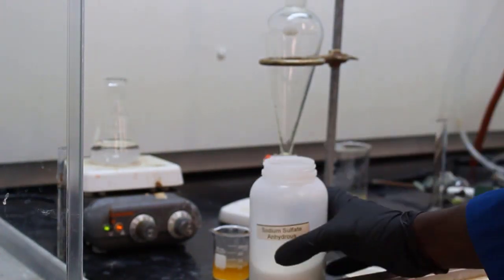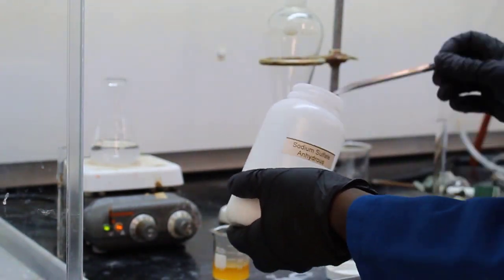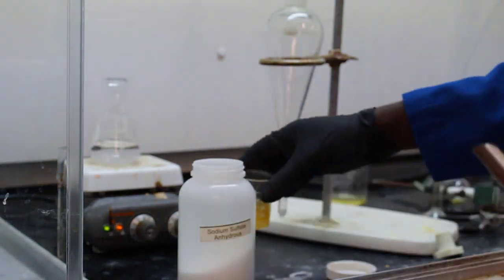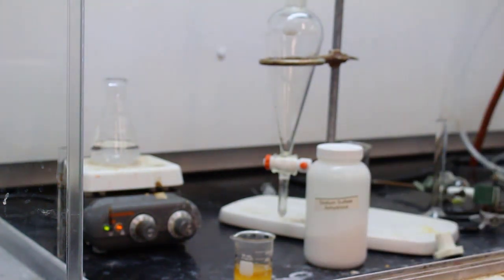Now they're going to dry the organic layer using the drying agent sodium sulfate, which will absorb any water that may have been retained in that organic layer.